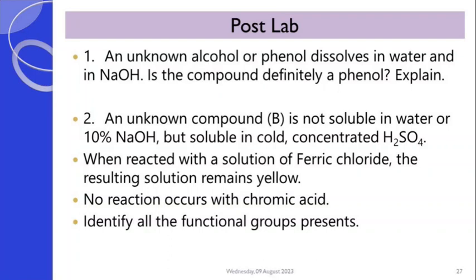The second question says that an unknown compound, B, is not soluble in water, nor 10% sodium hydroxide, but rather soluble in cold concentrated H2SO4.